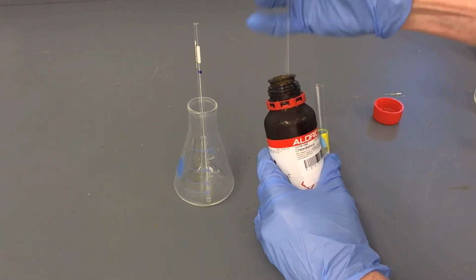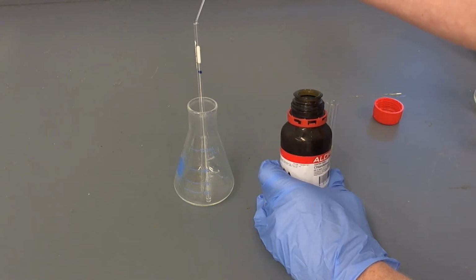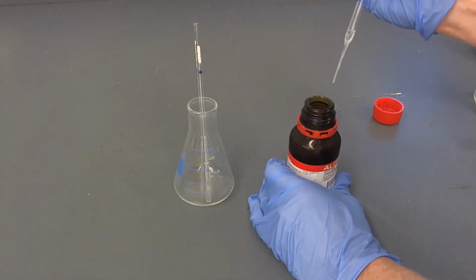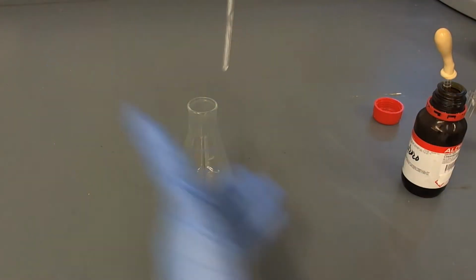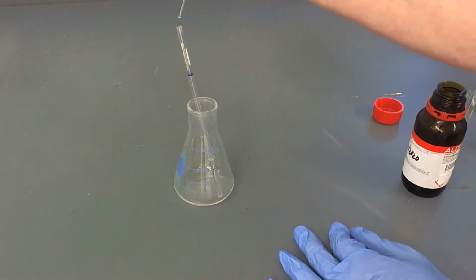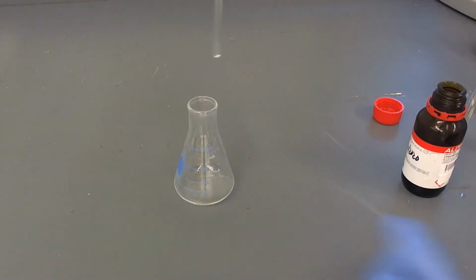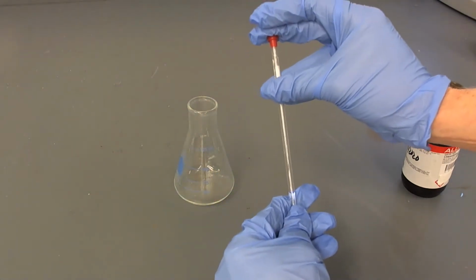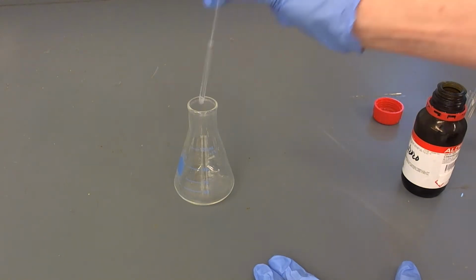Use the stock Pasteur pipette, draw some up, being very careful not to contaminate the pipette with your sample. Add the solvent, like so. If you're wondering how much, about the height of 3 fingers. So I'm going to add a little bit more. All right, perfect. Now I'm going to add a cap to the top, and you can shake it up a little, and your sample is ready to go over to the spectrometer.